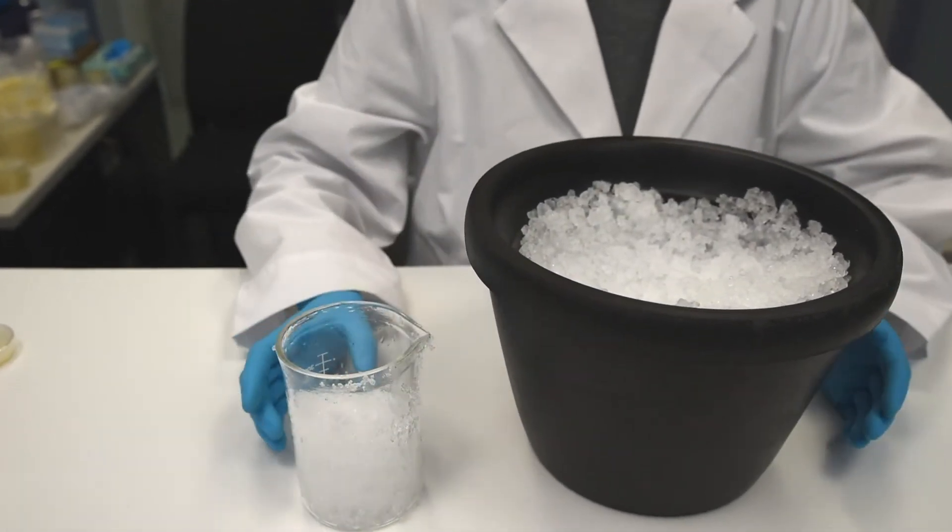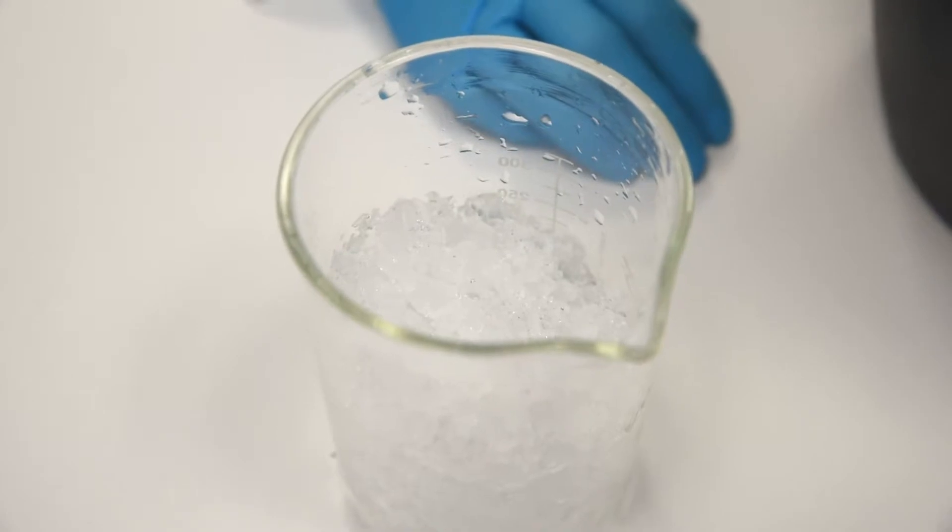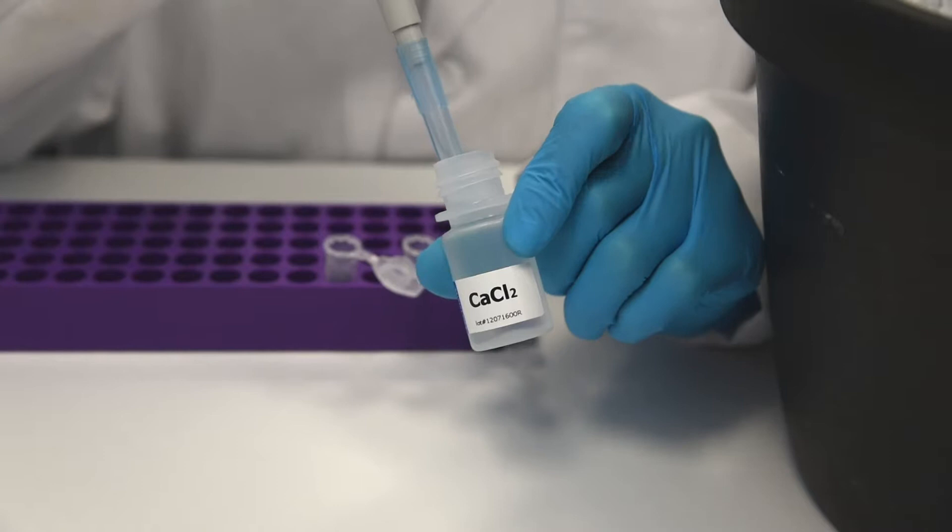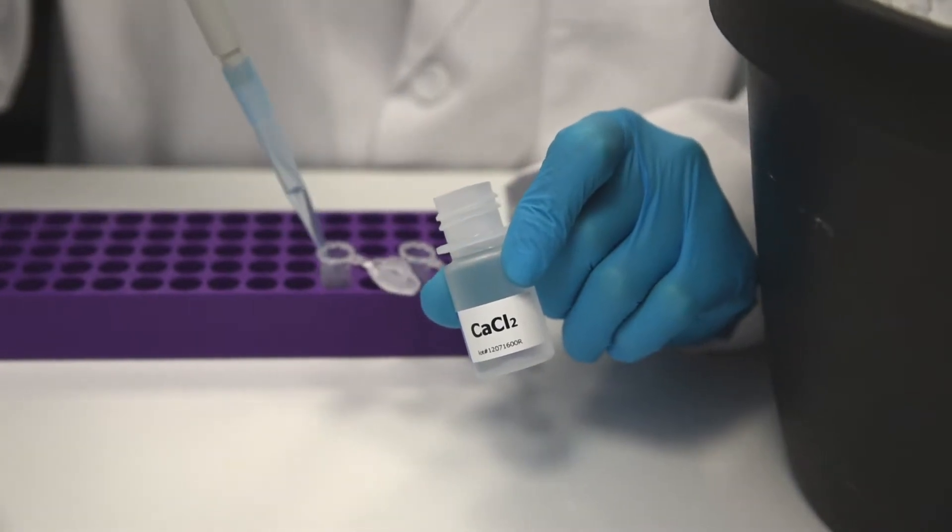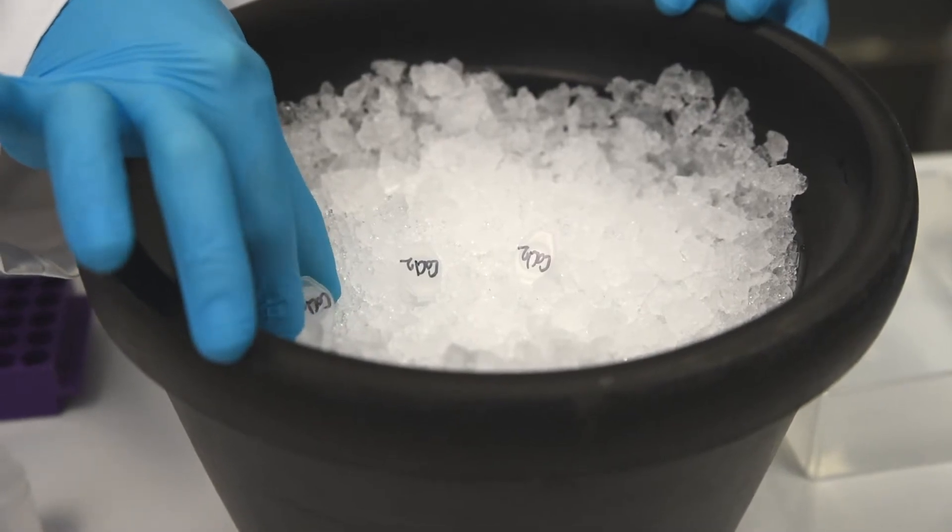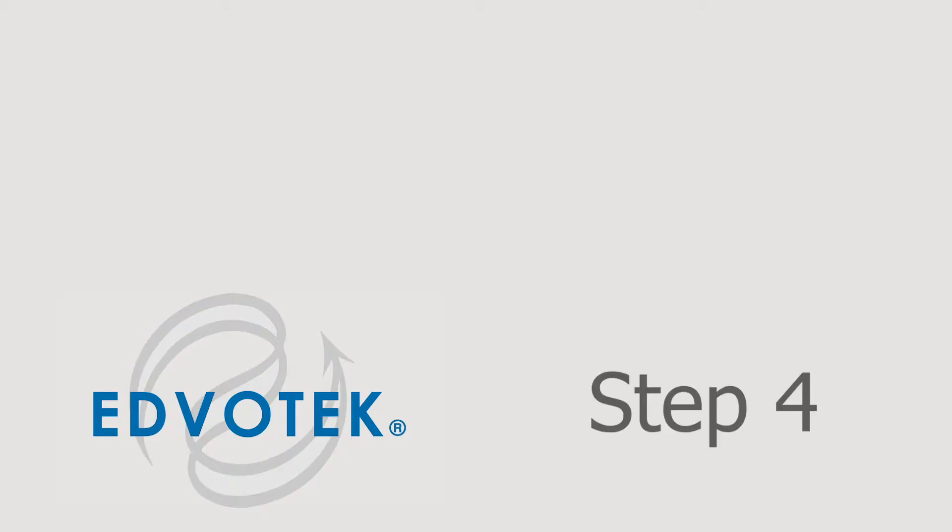Small ice cubes or crushed ice will help to rapidly cool the bacteria after the heat shock. Step 3: Dispense 0.5 mls of calcium chloride into microcentrifuge tubes for each of the 10 groups and place on ice.